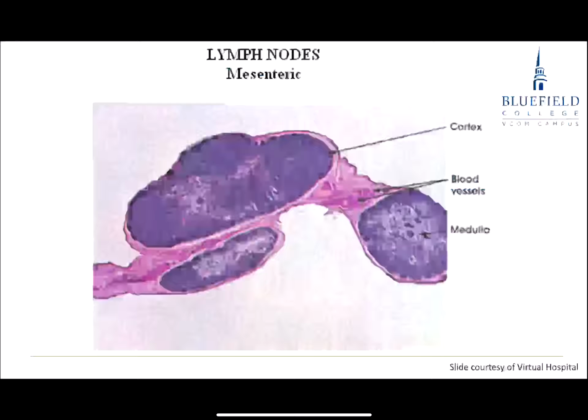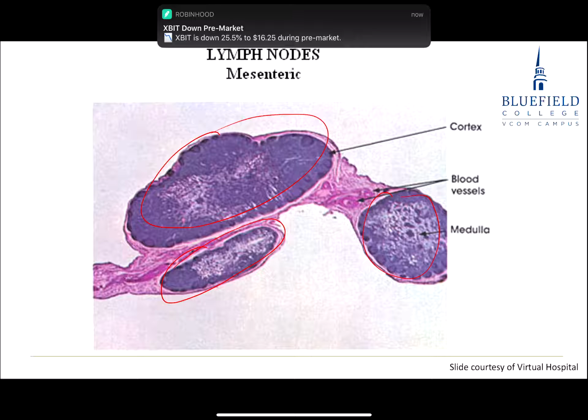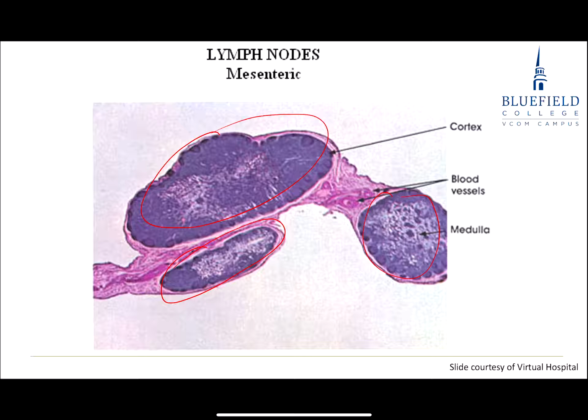And you can see the idea that there's a lymphatic vessel here running through connective tissue that has 1, 2, 3 lymph nodes right in a row. But when we look at it, even at low power, I can get the idea that I've got an outer cortex and an inner medulla, and staining very darkly, the cortex in particular, with lymphatic nodules in that. No hint of the crypts coming in right here. In fact, I've got a cortex and medulla, and the majority of my nodules that I see very well are out at the very edge of that cortex.